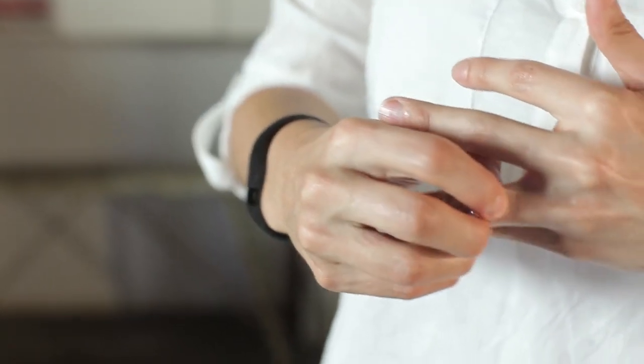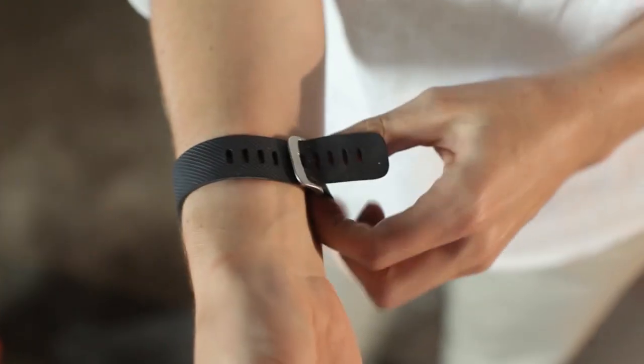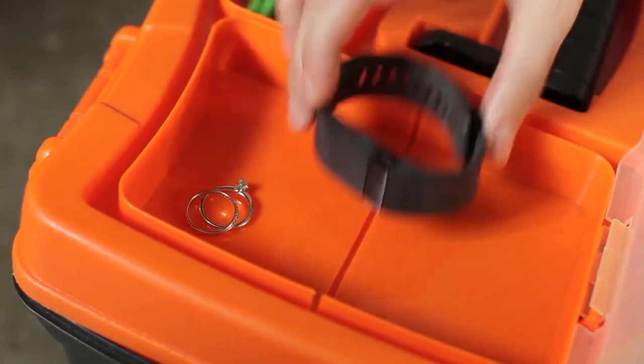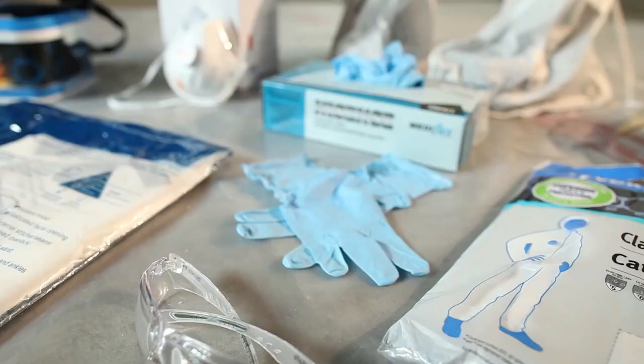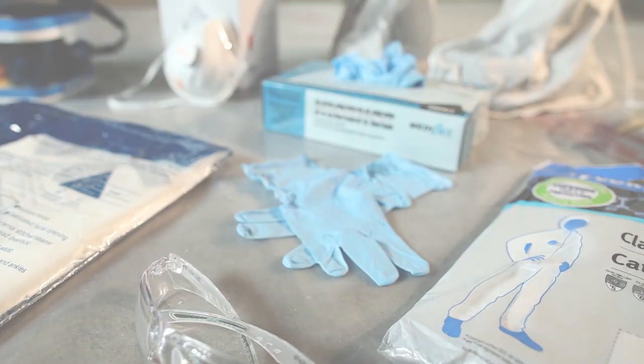Before putting on your PPE, remove all jewelry including watches and wedding rings. Your PPE items must fit properly and be in good working order. If you are using a respirator, it must be fit tested. The order of putting on your PPE is important.